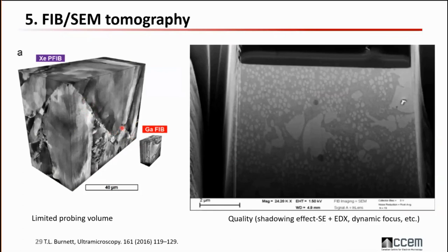So remind you that when we do the gallium FIB, the sample was tilted. That means all this imaging has been taken with the defects from the top. You might have the shadowing effect, as we can see here, where the surface close to the pore is bright and the one at the bottom is dark like this.